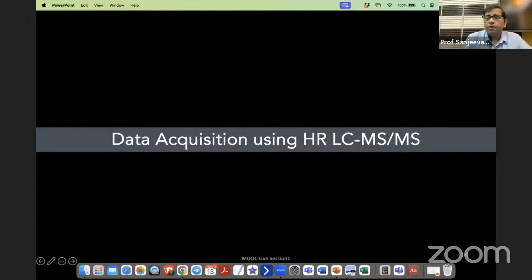All right. So now you have prepared a sample. Of course, there's some additional step involved as well, which means you have to clean up the peptide before you inject it in the mass spec. But now we are going directly to the lab, and Argya Banerjee will show you how to take these samples and acquire the data using the high resolution mass spectrometer, especially Orbitrap Fusion. So Argya, please display the instrument and discuss it.